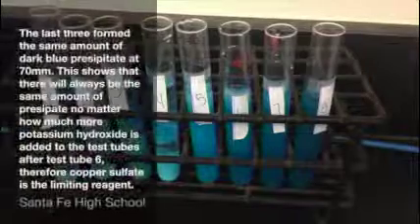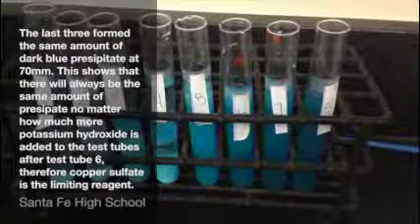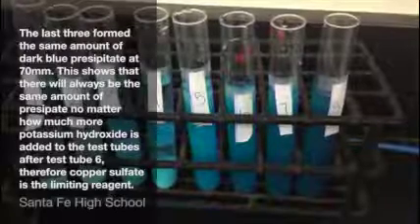The result of the lab was that copper sulfate was the limiting reagent. Once the copper sulfate was used up completely in the experiment, it stopped making the precipitate and the supernatant.